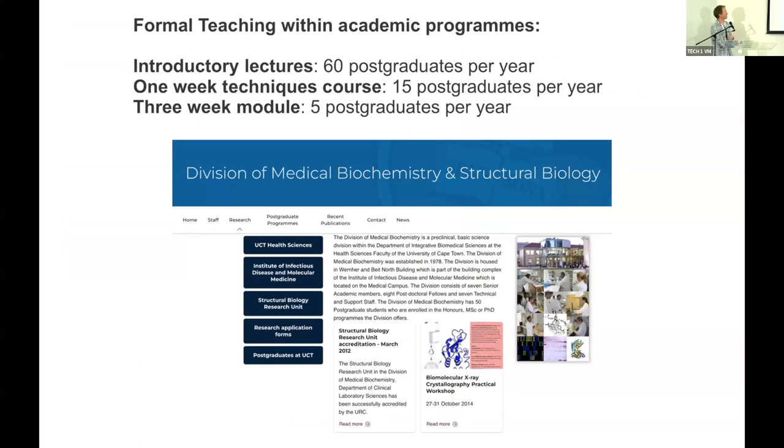In addition to this, within an academic program, there's some teaching that happens. These 60 postgraduate students get an introductory lecture. It's an hour-long lecture. These ones over here get a 1 week course where they learn a little bit about how to operate things. Then there's a 3 week module for students who are super enthusiastic, etc. Okay.